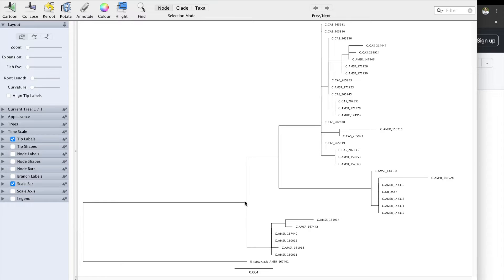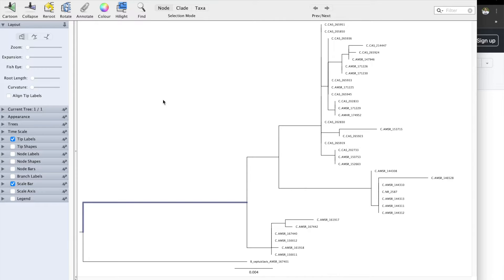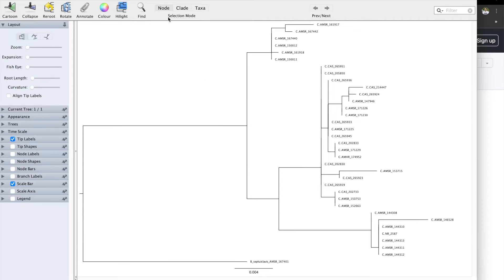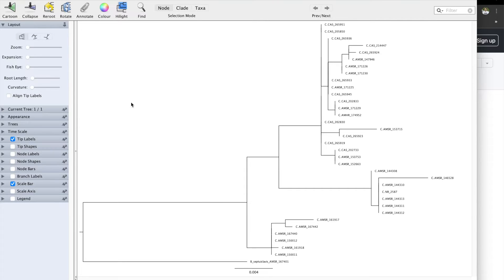Rotate is something that we're going to use all the time as well. Right now, we have these samples ending with 11 and 12 at the bottom, and all of the rest are at the top. If we click on Rotate, it's going to bring the 11 and 12 to the top and the rest to the bottom. Let's click on Rotate again and keep it like this.